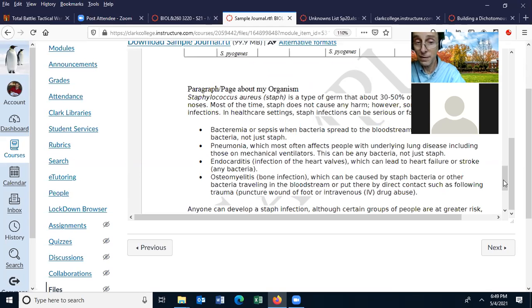Remember, an observation is what you observe, the test results. The conclusions are your interpretations of that result. So you look at the gram stain and you see purple cells. That's your observation. The conclusion is that the cells are gram positive. Everyone notice the difference?